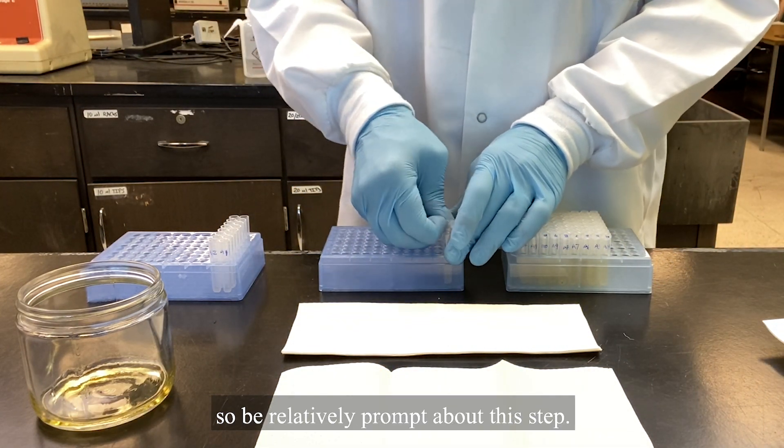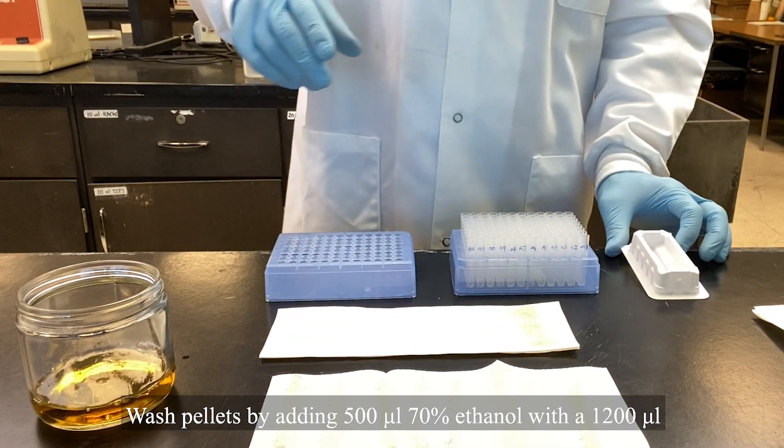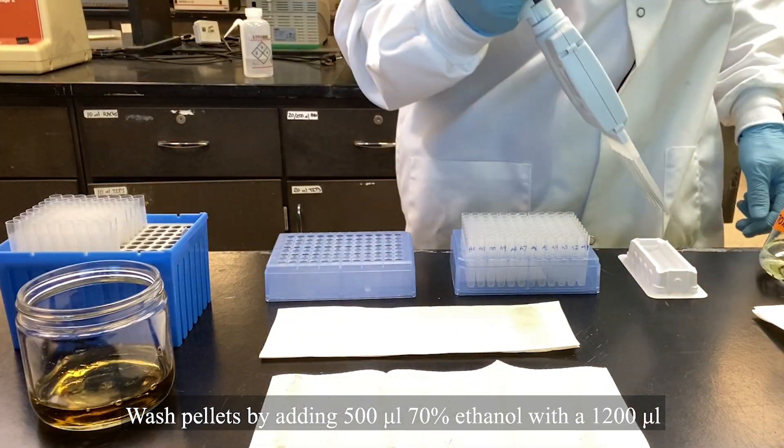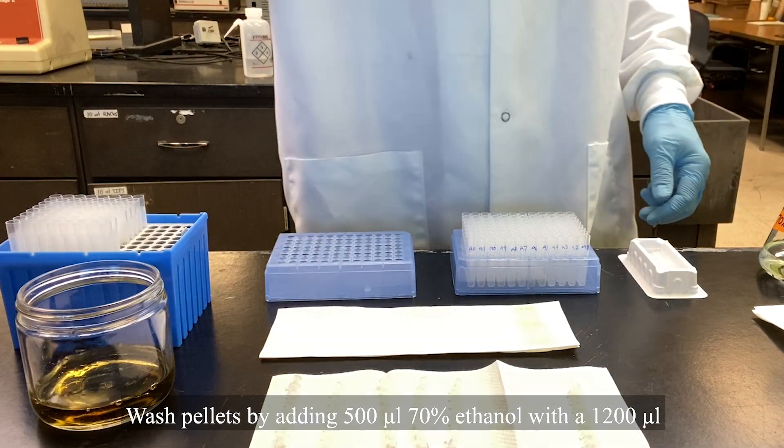Wash pellets by adding 500 microliters 70% ethanol with a 1200 microliter multi-channel pipette.